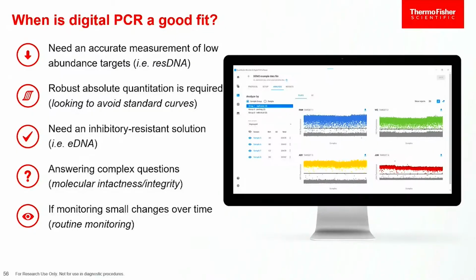Okay. Another good point to use digital: there is a technological limit that we have in qPCR, especially in gene expression. The example I gave you was anywhere from 0.25-fold to 256-fold. That limit in qPCR is about two-fold. Anything less than about 1.5 or two-fold difference, we just can't resolve, and it's not that we don't make good instruments. It's just across the board, everybody's technology.